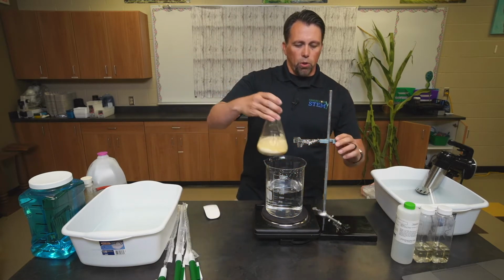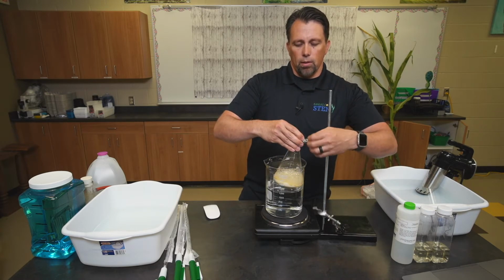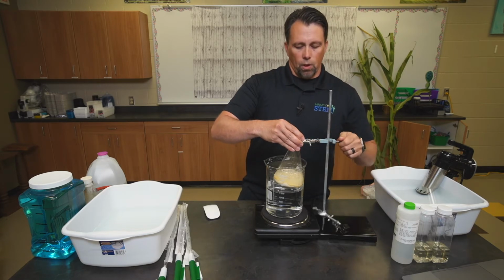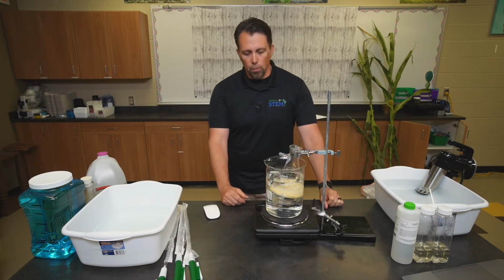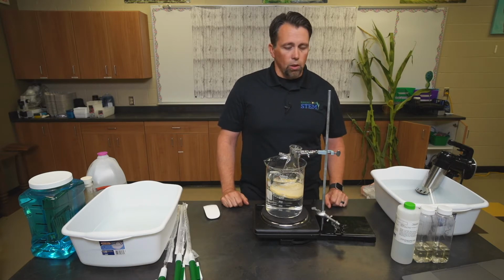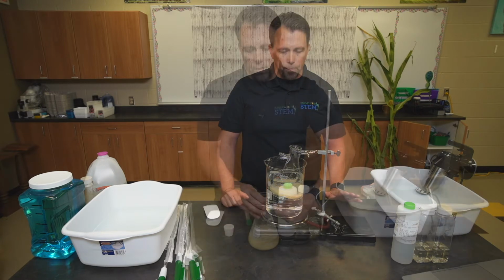Don't need to boil the water yet, but you can have it warming up. Move it down into the water. If you set the flask onto the hot plate, you'll end up scorching the corn and making a mess, so it gets really hard to clean out. So you want to boil this for about 10 minutes. It will thicken up, especially if we typically let them sit overnight. Class periods aren't long enough to run through the whole thing necessarily in one setup, so it will turn into like an oatmeal consistency overnight.